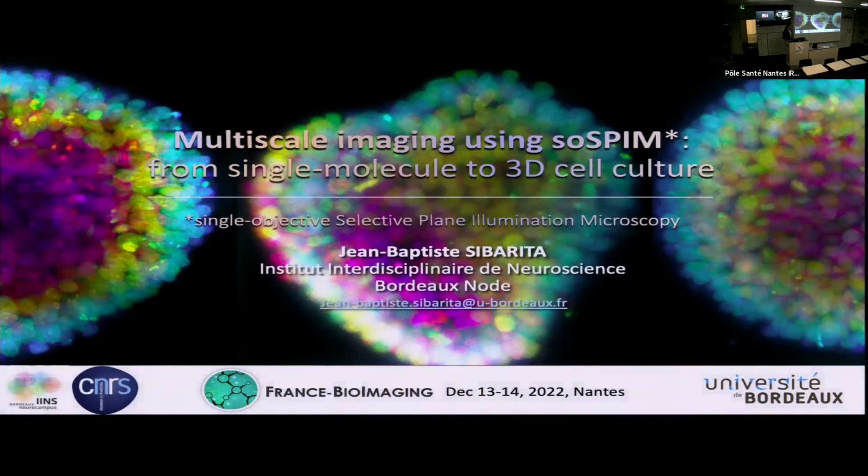And so today I will present our ongoing work trying to bridge the dimensions from the single cell, single molecule resolution up to the organoid scale. And this through a technique that we have co-developed with the team of Virgil Gasnoff in Singapore, which is called SOSPIM, for single objective selective plane illumination microscopy.